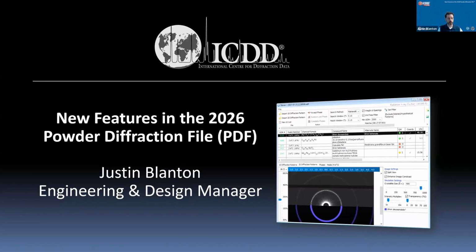Okay, thank you for joining us today. This is the New Features in the 2026 Powder Diffraction File webinar in session. My name is Justin Blanton, and I'm the Engineering and Design Manager at ICDD. In this session, I'm going to be showing you many of the new features that you'll find in the new 2026 version. Now, this version was just released only a few weeks ago. So this just came out at the beginning of September.